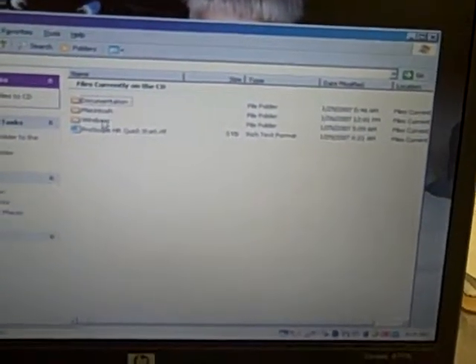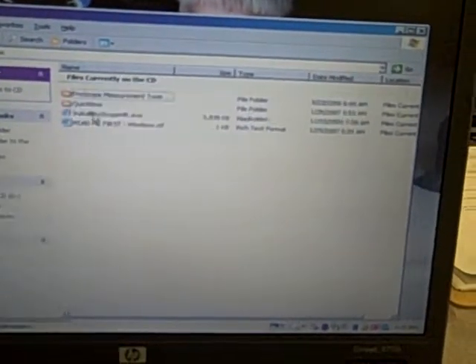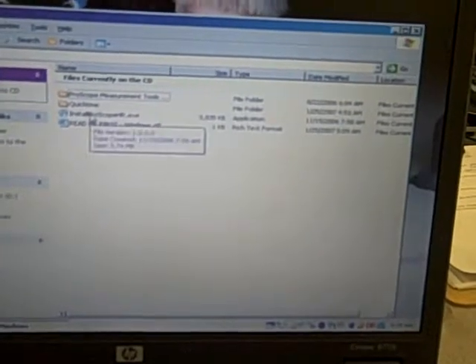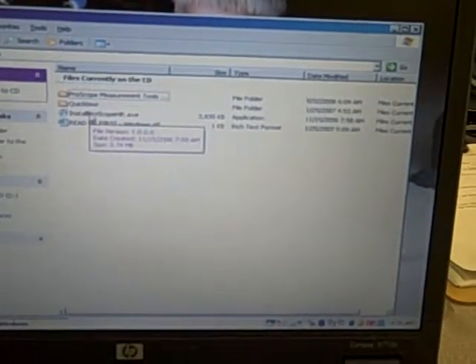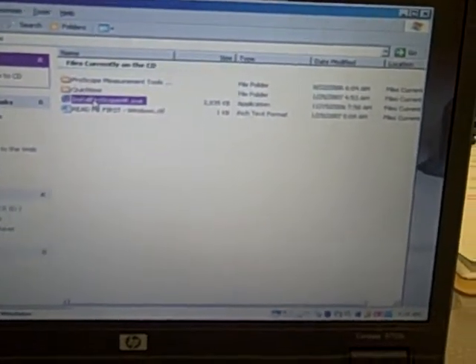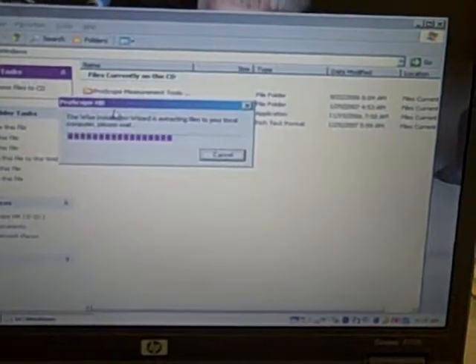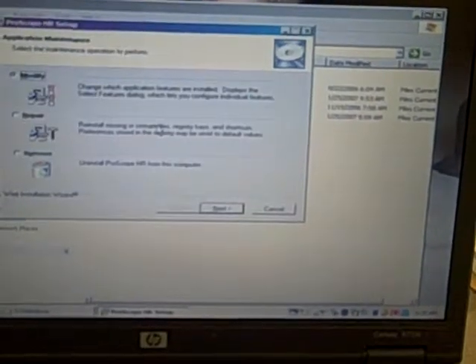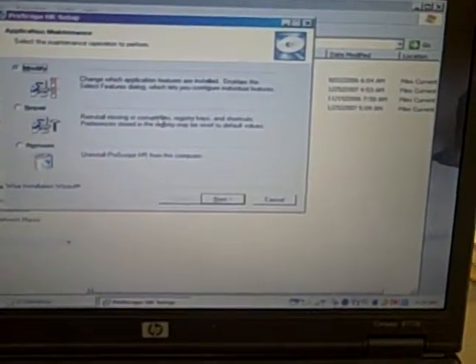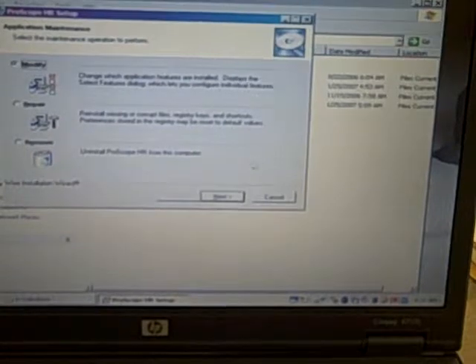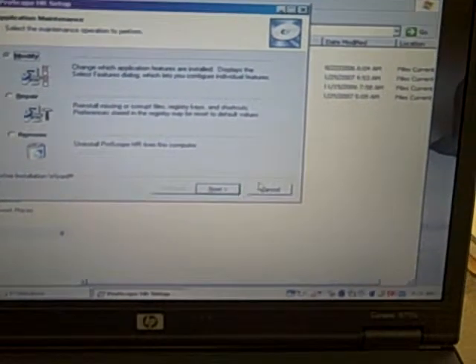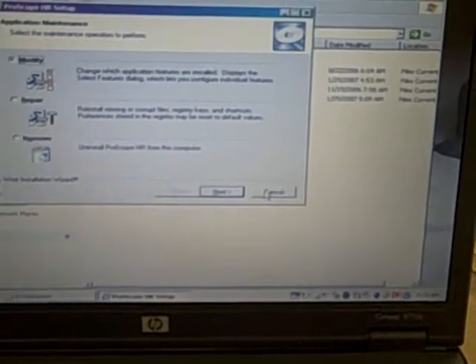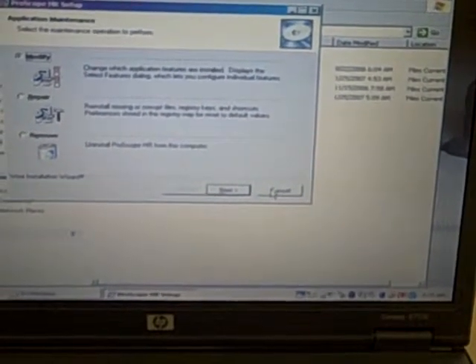Once the screen opens up, you're going to double-click the Windows folder and then double-click the Install ProScope HR.exe. And then you're just going to click through the series of next, next, next until it's all finished.